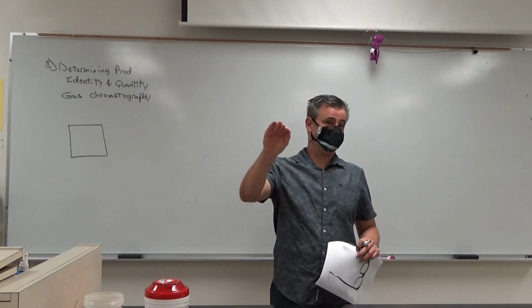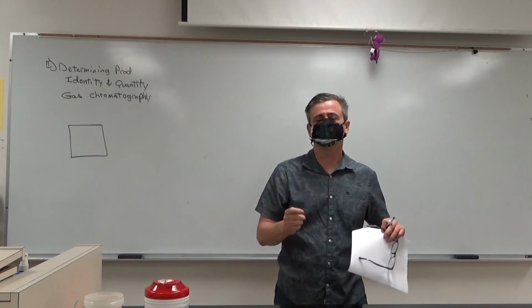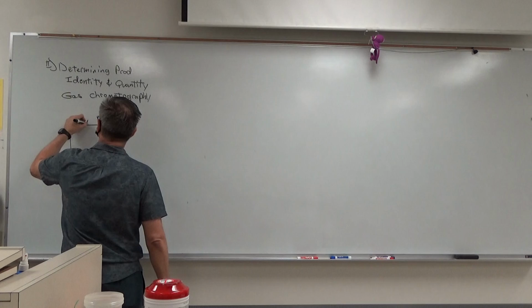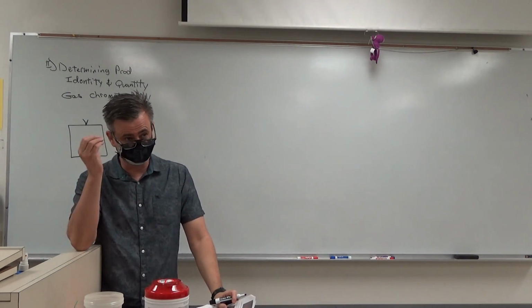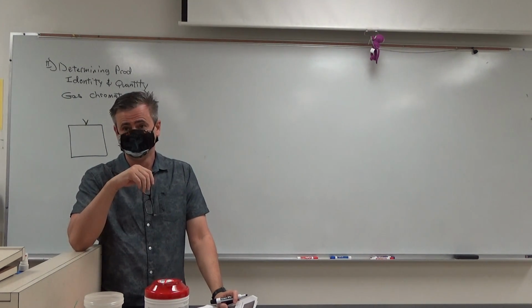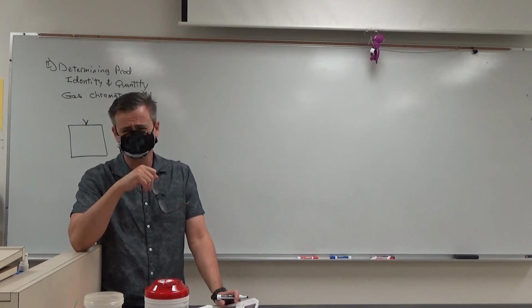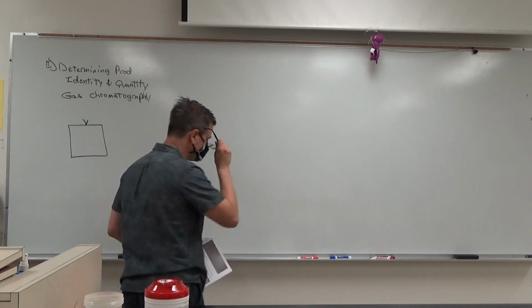And that ramp is often very specific, a degree per minute type of thing, kind of like a melting point apparatus. You will have your sample dissolved in another solvent. It's going to be dissolved today primarily in chloroform, with a little bit of acetone in there. The acetone serves a little convenient purpose, which I will explain to you in a minute.